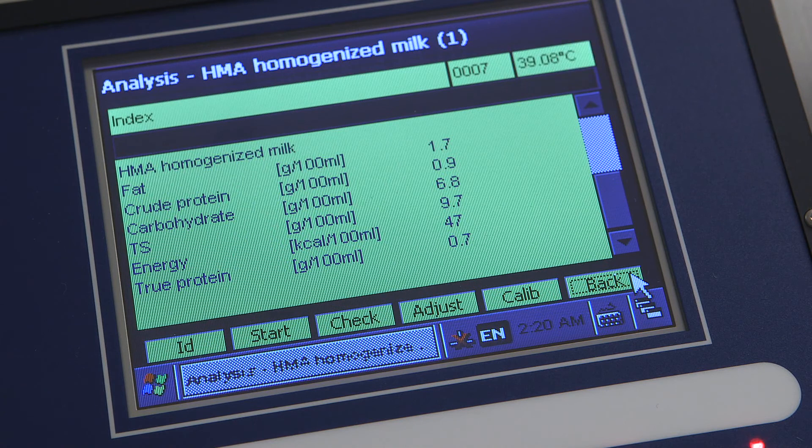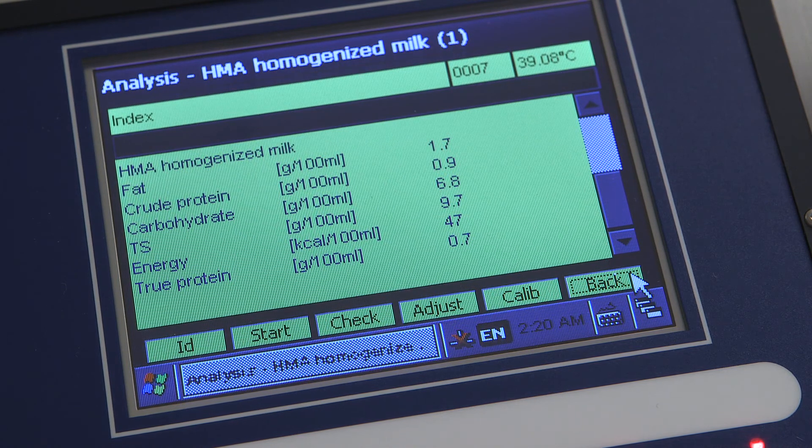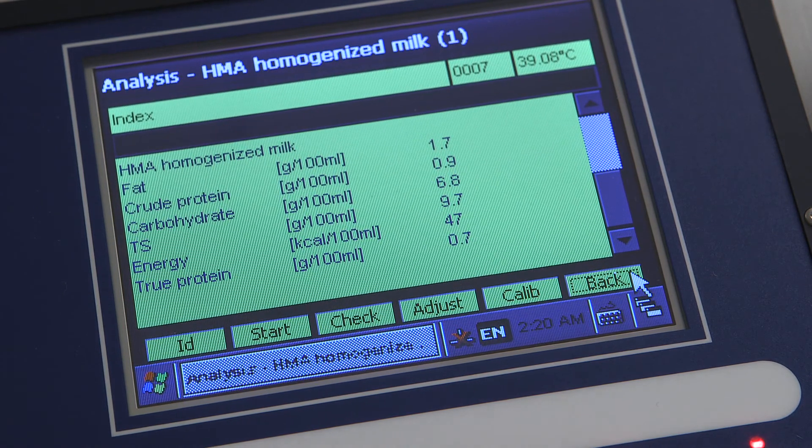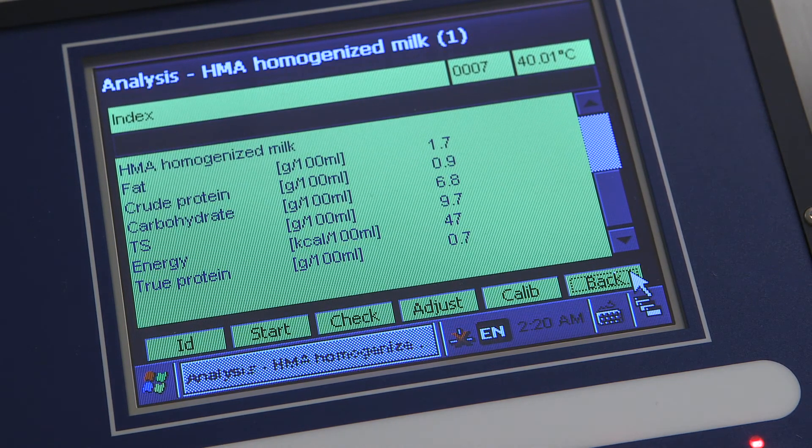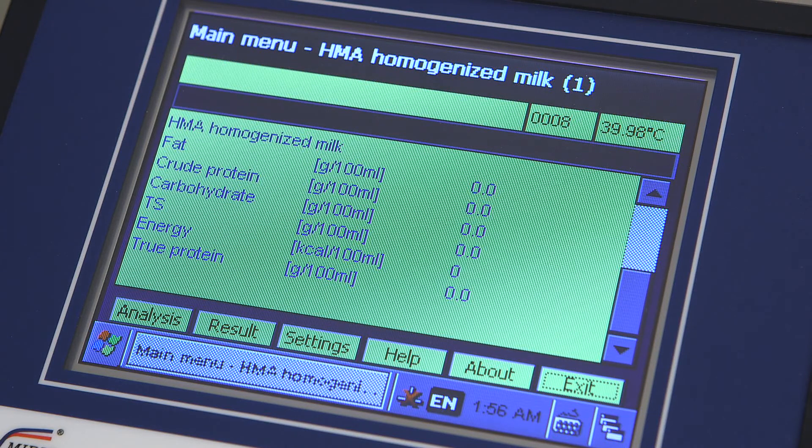The Mirris Hue & Milk Analyzer displays the results for each sample as they are analyzed. The optional printer gives hard copy of your results. The system has an internal memory that can save approximately 4000 measurements.